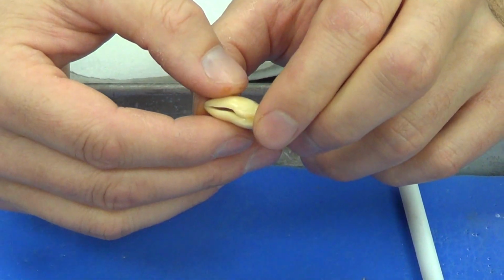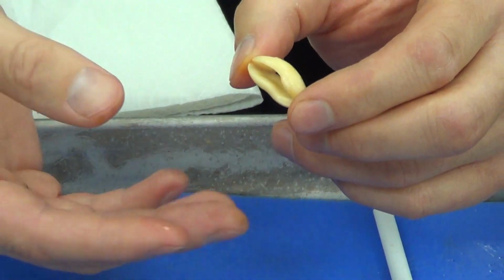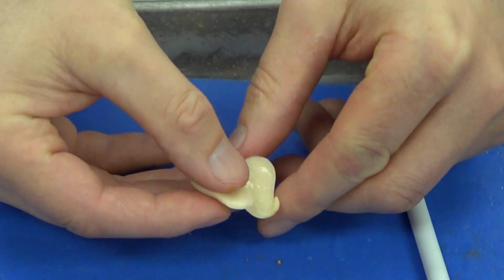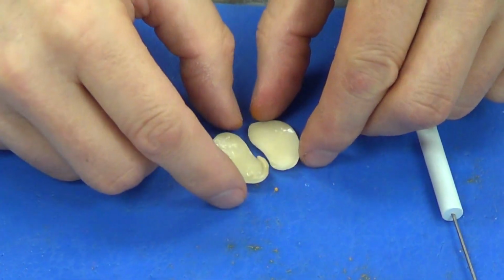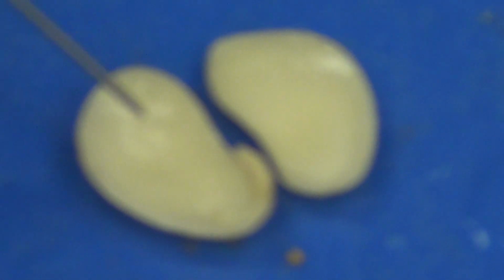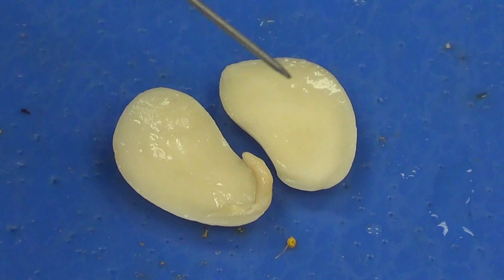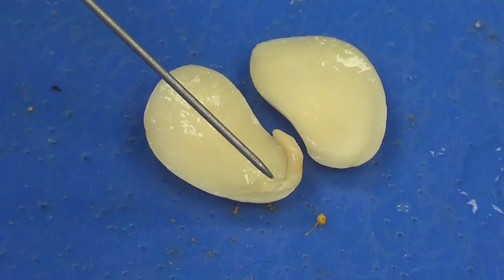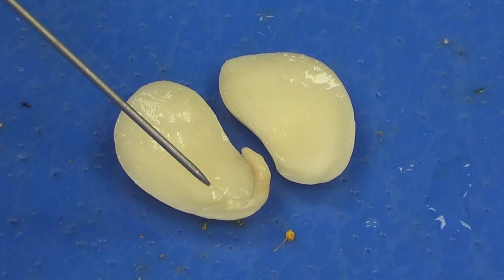I'm going to just ever so gently give it a very small pinch. This is a dicot, so it's going to split in two normally. And as I open that up, you can see the two halves of the bean seed. What you're looking at right here is all going to be cotyledon, food for the developing embryo, all cotyledon. And then you can see this structure right here. This is going to be our embryo.